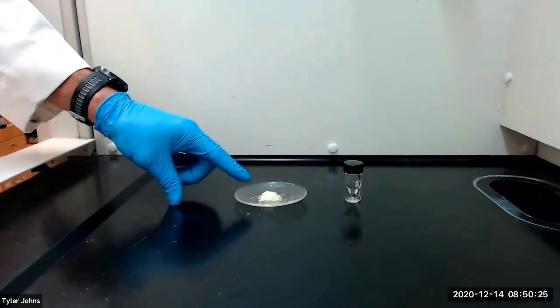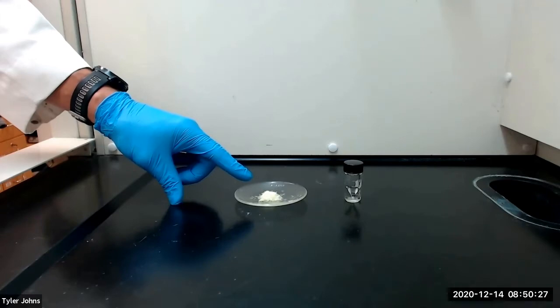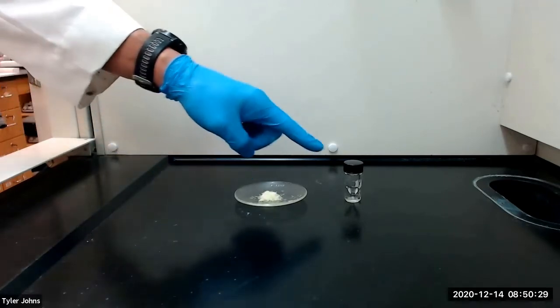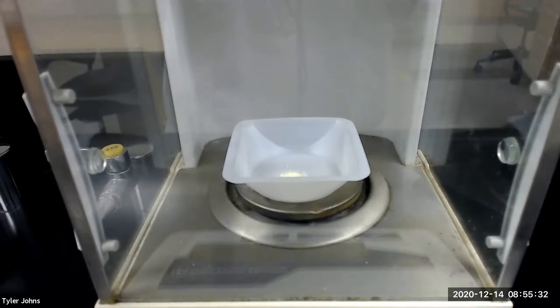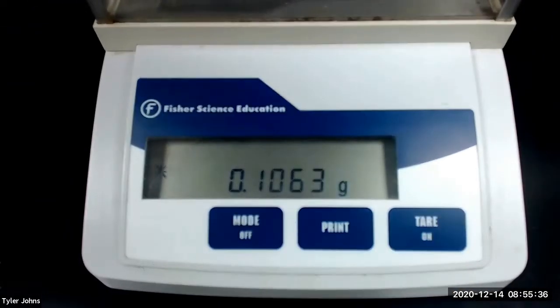We will begin by adding approximately 0.1 grams of the benzil product from part B to a 3 milliliter conical vial. The mass of benzil that we will be using is 0.1063 grams.